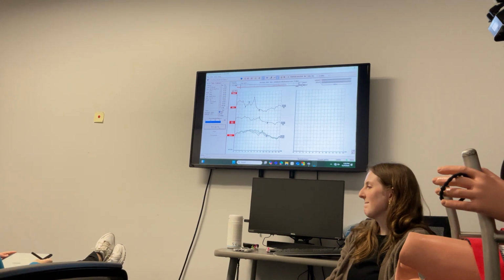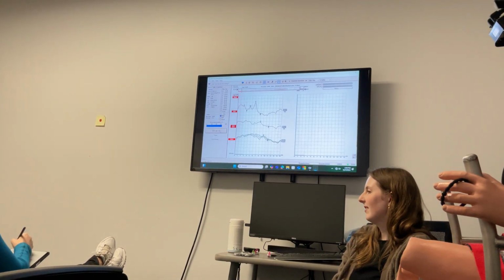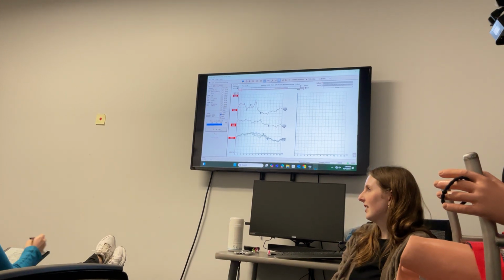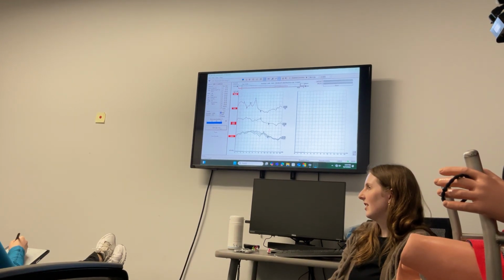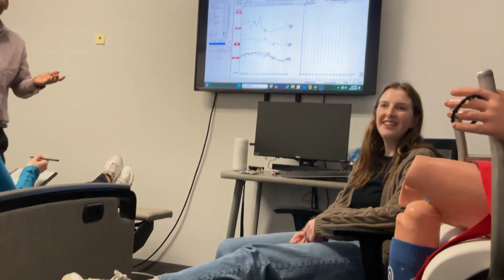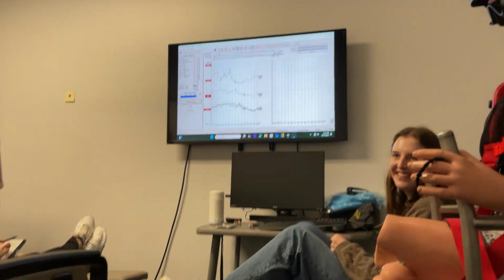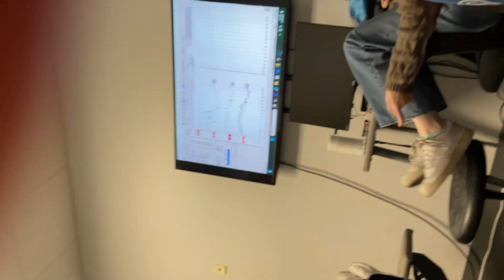Shall we do some loopback recording to just familiarize you with the chirp? Loopback is when you can actually look at the kind of stimulus you're playing to record the response. Okay? Sure. So instead of connecting here, we'll connect it to the loopback. What is this narrowband chirp? Both broadband and narrowband.